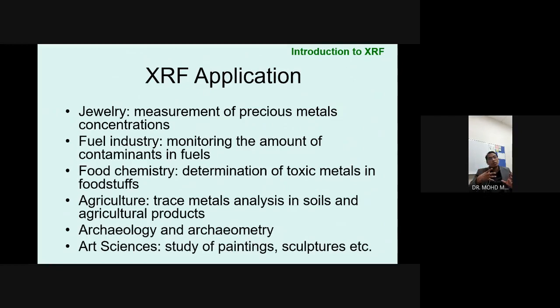Once we know the trend or any key factor, it can be a foundation to improve the accuracy of the XRF. One thing that we realize is that when you are measuring using XRF, the problem is the redundancy of peaks. It means that the gold peak can be redundant with another metal.